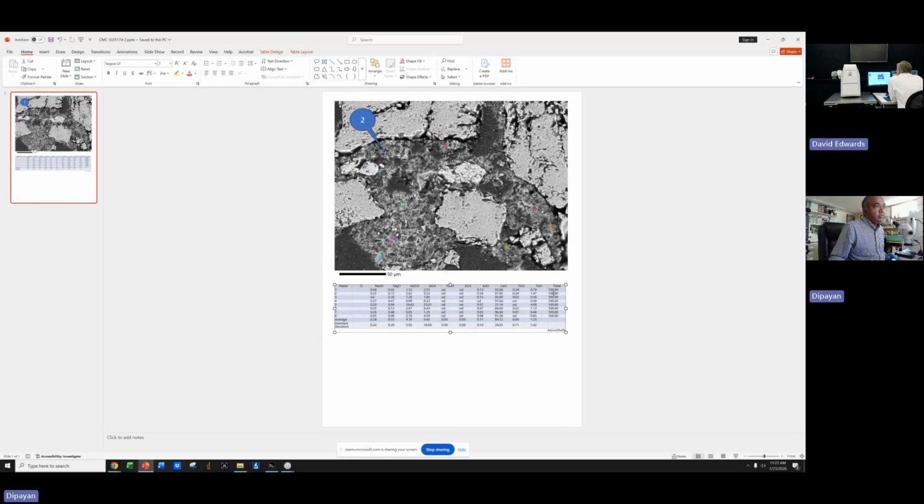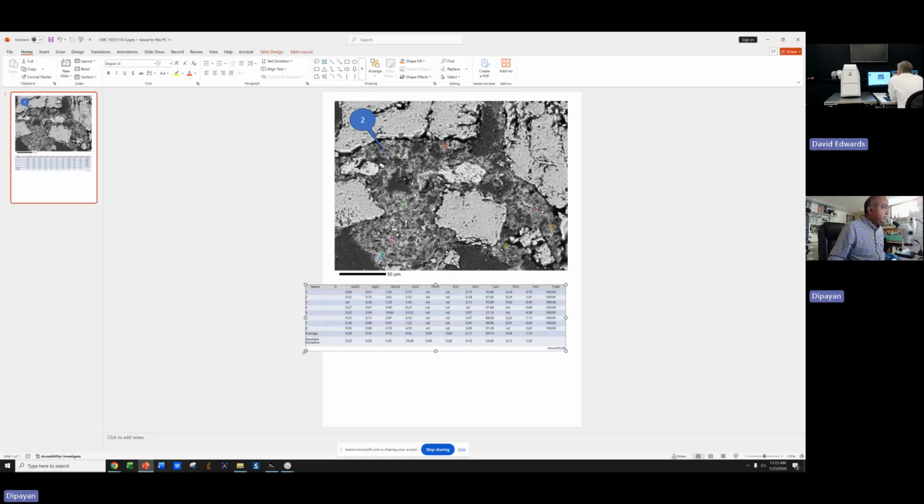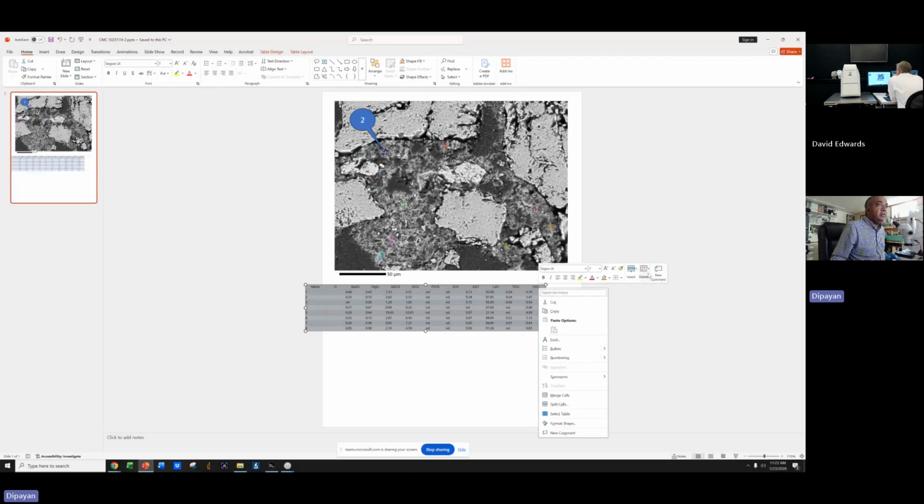I don't need this total. I get rid of all this. These are useless information. Average has no meaning when I have very different phases. Yeah, exactly. So I get rid of the total. Total has no meaning because they're normalized anyway. So this is how, and then I add a separate column here. Oops, undo. I add just one column there.